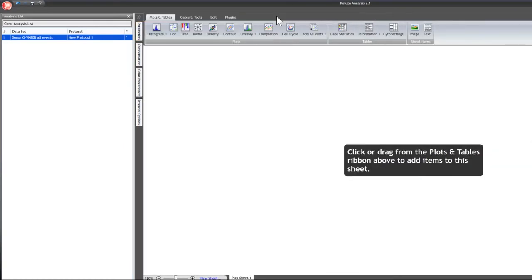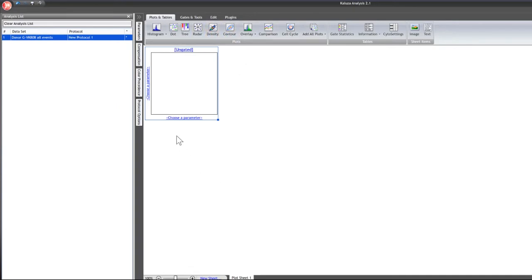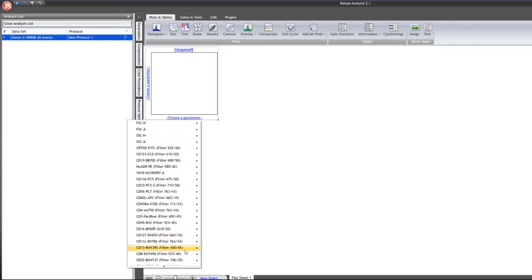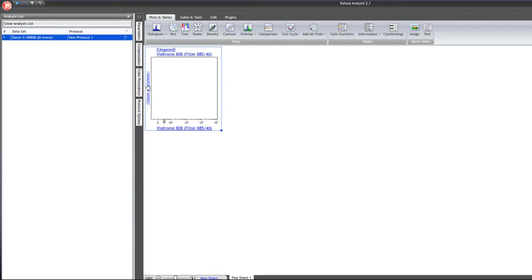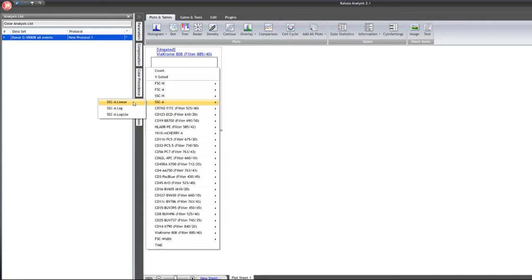Once that's complete, click the X and start to add plots into your Clusa analysis. With these plots we're going to adjust compensations, apply scaling transformations, and pre-gate populations of interest. Click on dot to insert a dot plot — density or contour options are also available. Where it says 'choose a parameter,' click to see all available parameters. I'm going to start with the live dead parameter and select logical scaling for it, then choose side scatter for the Y parameter and make it linear.